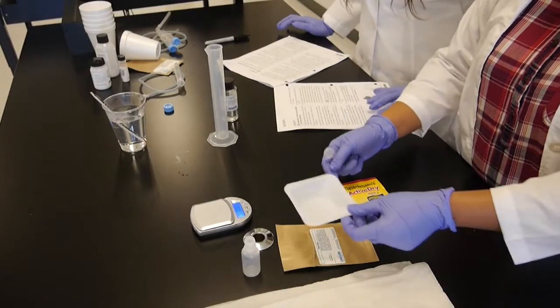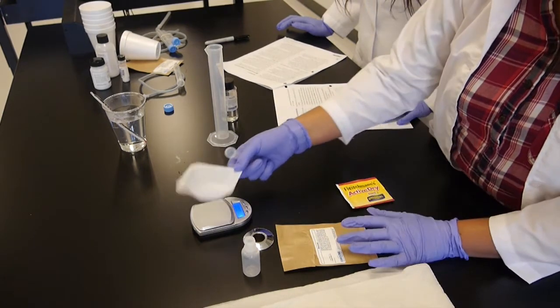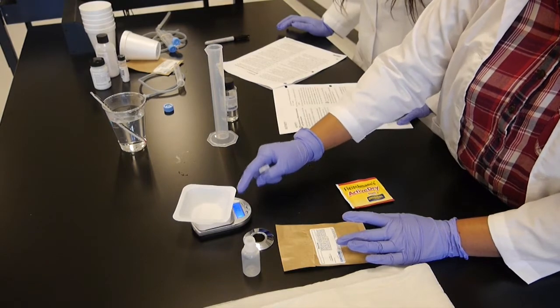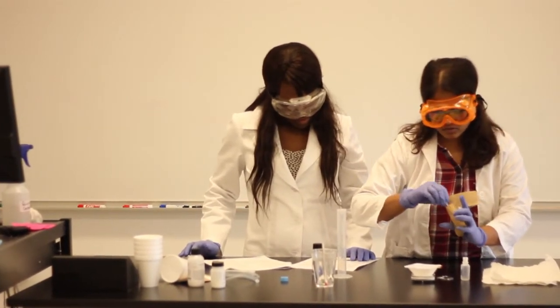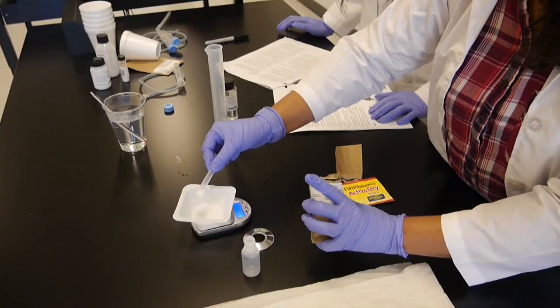So, start of the procedure. Let's weigh out about 1 gram of sucrose. Let me put the pan right here on the weighing balance and tare it so that we can get only the mass of the sucrose. Let me try to get 1 gram.